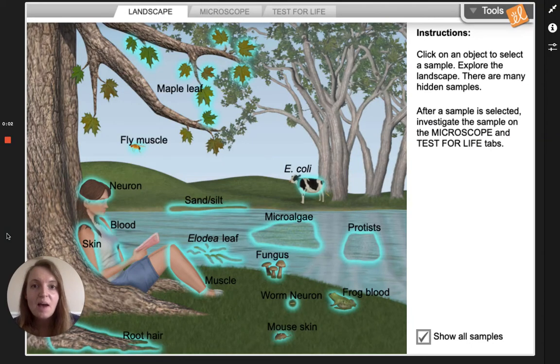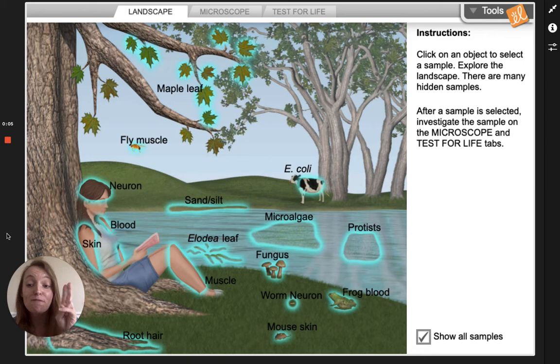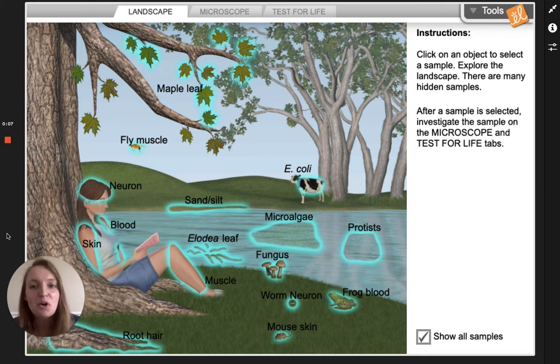Hi everyone! I'm gonna show you how to use a virtual microscope in Gizmo.